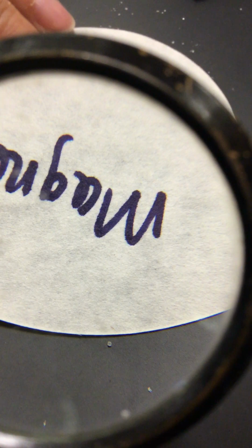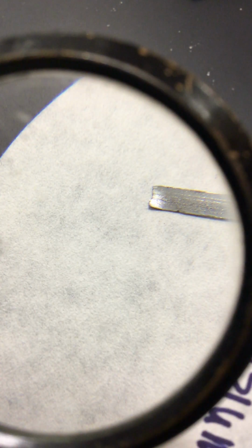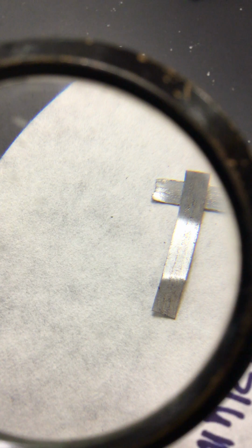And we have some magnesium. And there's what magnesium looks like. Let me grab a couple little forceps here. You don't really need to be careful of this, but I just don't want my fingers in there. So you can see this is bendable. You can bend this like you'd bend any kind of a metallic substance. So there's magnesium.